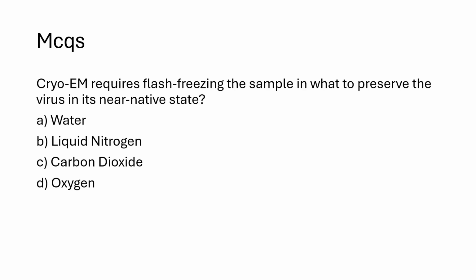Cryo-electron microscopy requires flash freezing the sample in what to preserve the virus in its near native state? A. Water. B. Liquid nitrogen. C. Carbon dioxide. D. Oxygen. Answer is B. Liquid nitrogen.